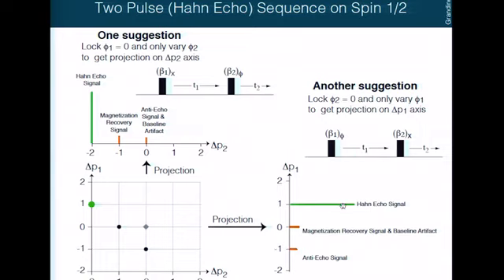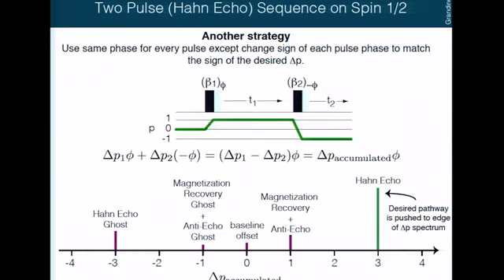Then I would have projected out the other way, and I would have got it separated. So there I would have needed two phases. Actually, there's another way to do this, which I think is kind of fun. And this is the way that we try to take even more complicated experiments and reduce them down to just a few number of phases.